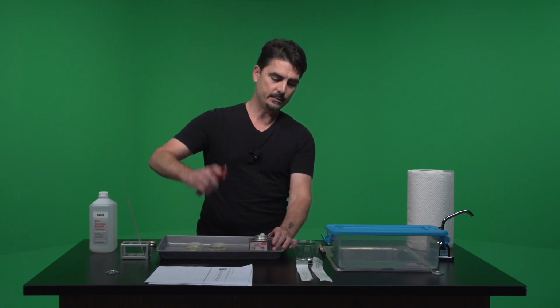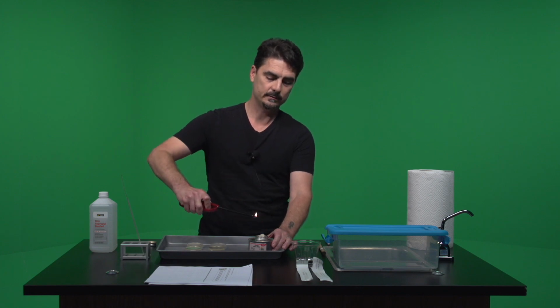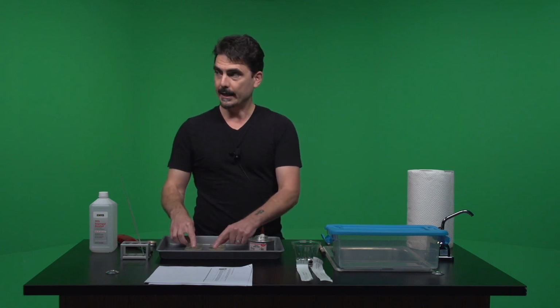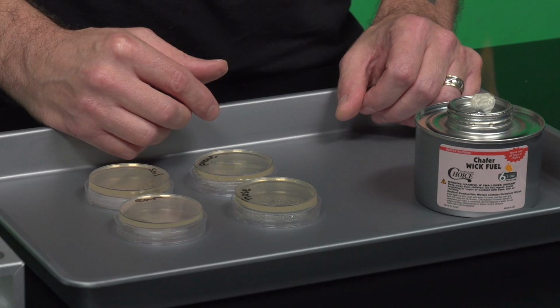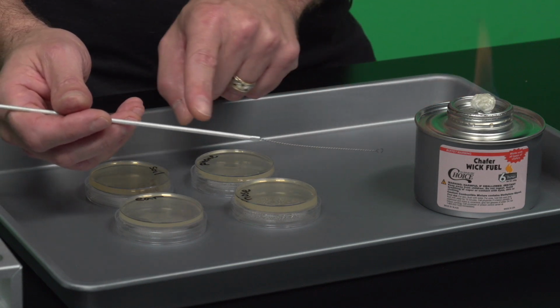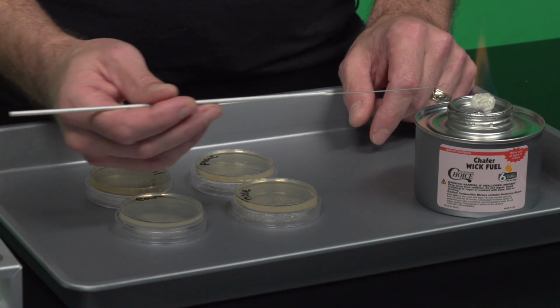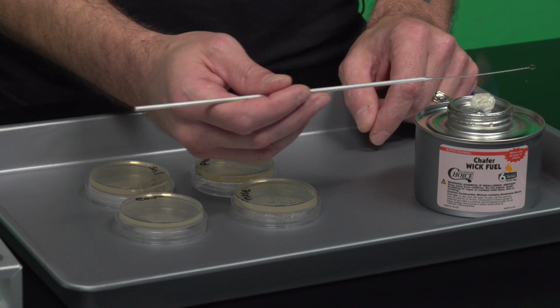So the first thing we're going to do is light up our sterno, get a nice big flame on that, and make sure we let it get nice and large, okay? And now for your loop, what you need to do is sterilize, first of all, since this is the first time using it today, the whole thing going up. And so you'll have a tendency to want to do this and move back and forth. That's very inefficient.